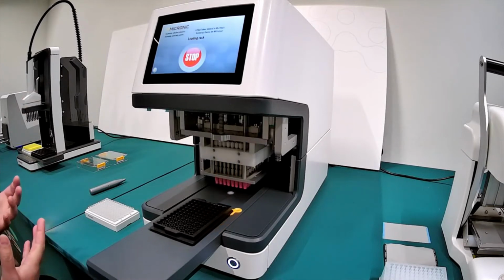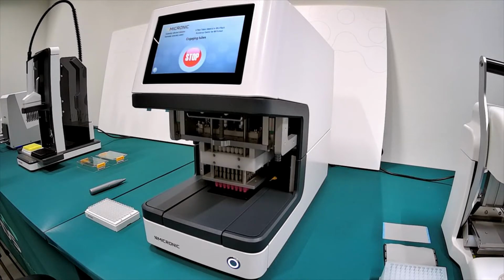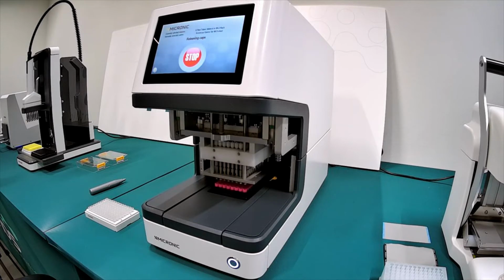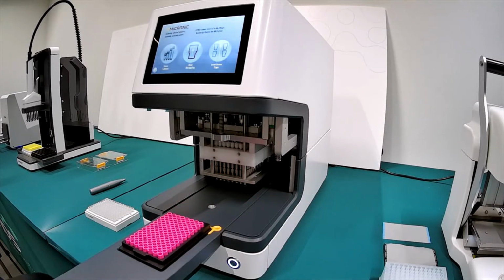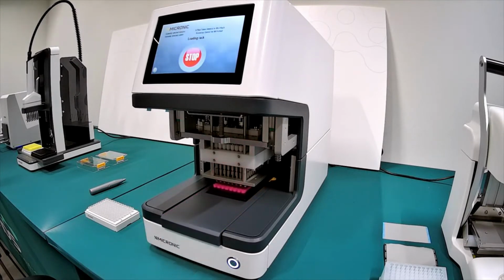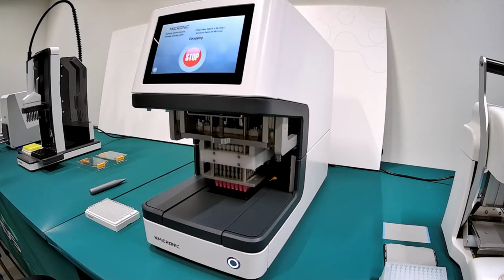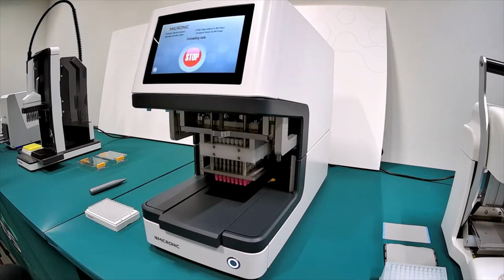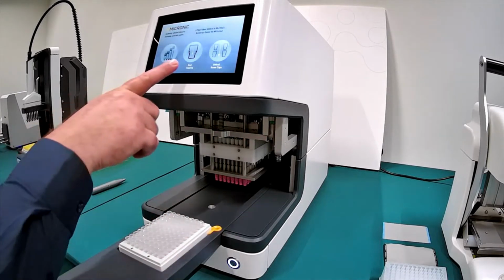Or you can do this if you want to have more racks uncapped before you start recapping again. And of course, if you want to load the caps back onto the machine, press on cap. It starts capping from the cap carrier. And then the tray comes out and unloads the cap carrier, which is now empty of the caps. So then you can, of course, load your tubes again and press on start capping.